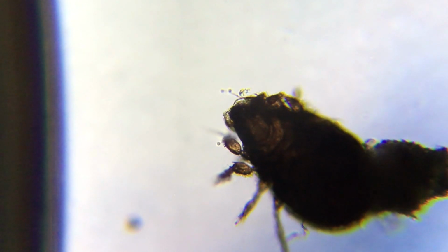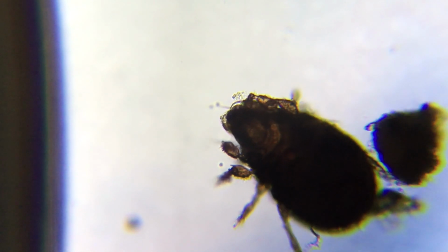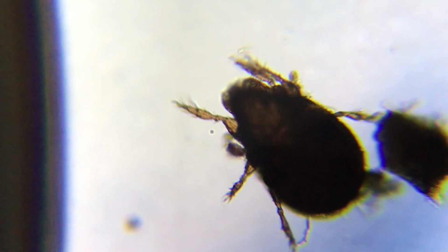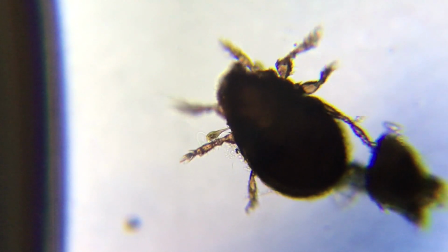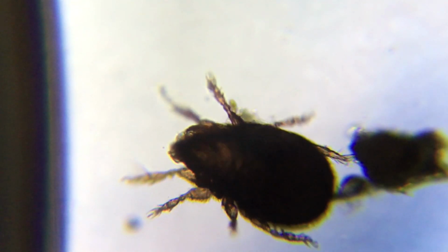Here we have another mite. We also don't know what it is, but this one even looks almost like a beetle. In a second, we're going to show you a dark field of the same beetle with that same little grain of sand. We got both of these from moss, which I wouldn't have expected. And here's our little buddy holding on to his grain of sand.